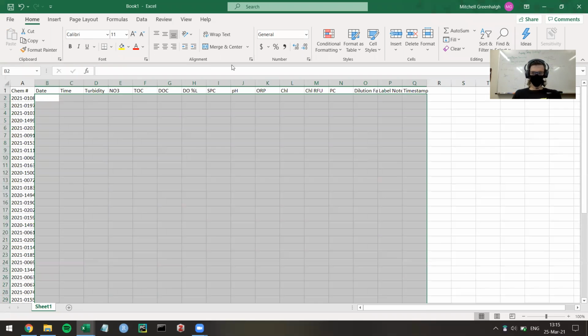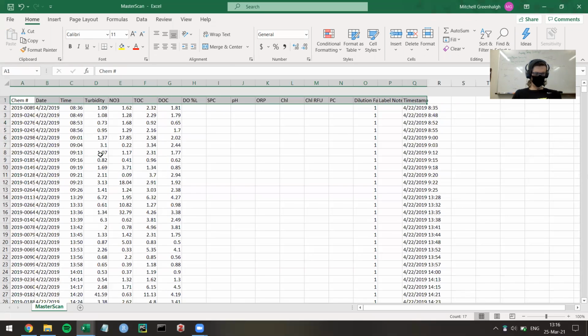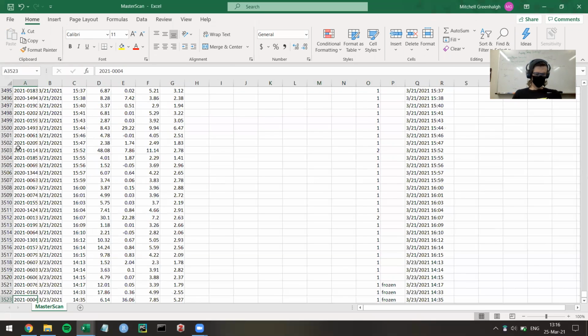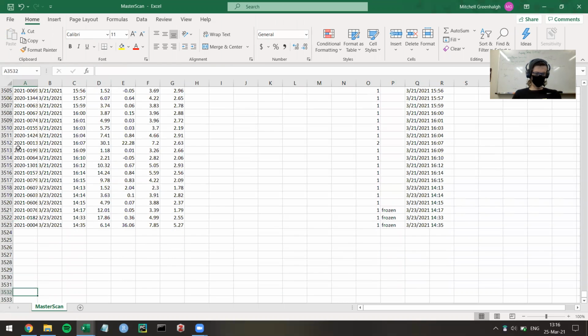So what you're going to do is first, pretend this is the MasterScan, and this is a new day, and you're just going to enter it in right here under the last results that were run. You're going to start by typing out all of the sort chems.